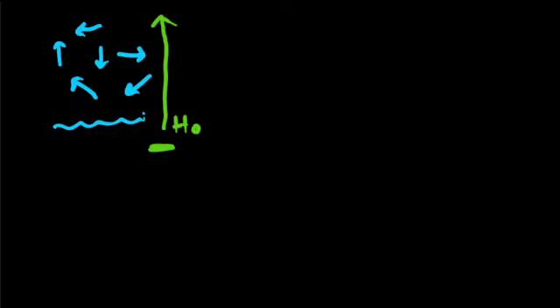Then when we place it inside of our instrument though, we have what's called a big, strong external magnetic field. And we tend to call that H naught, H with a little zero. So this represents the big, strong magnet of the instrument that we put our sample inside of. So instead of all of the hydrogen atoms being randomly oriented, they all start to line up with that magnet. So every hydrogen atom, zoop, lines up with the big, strong magnet.